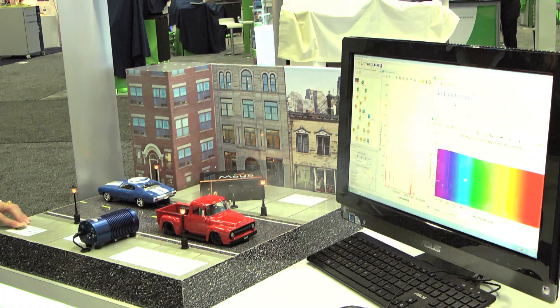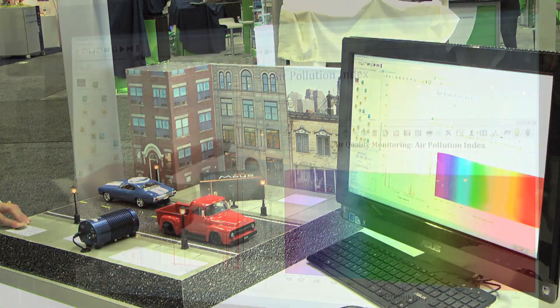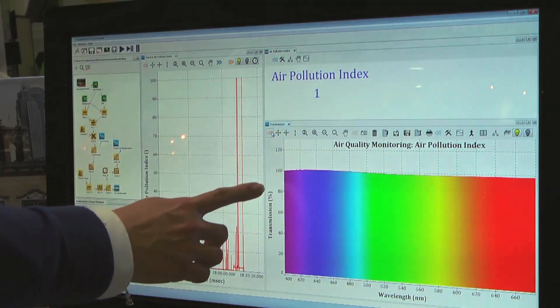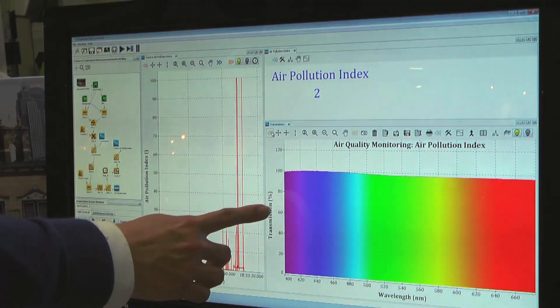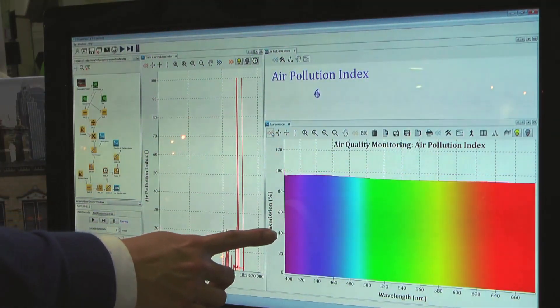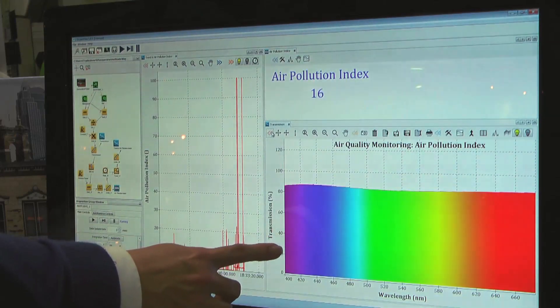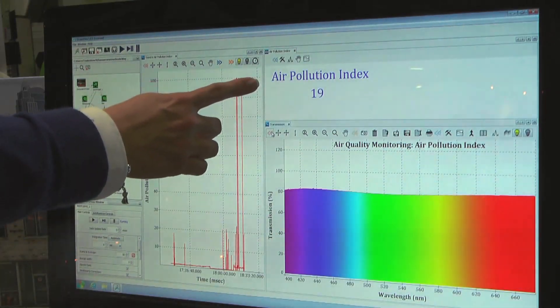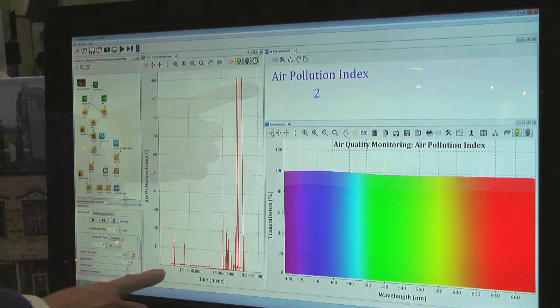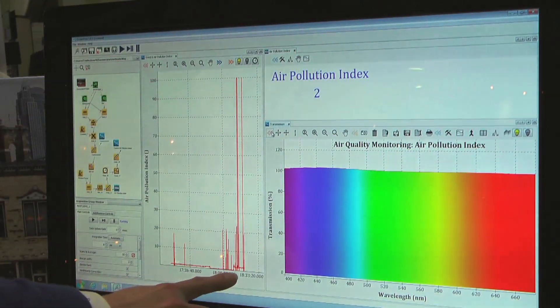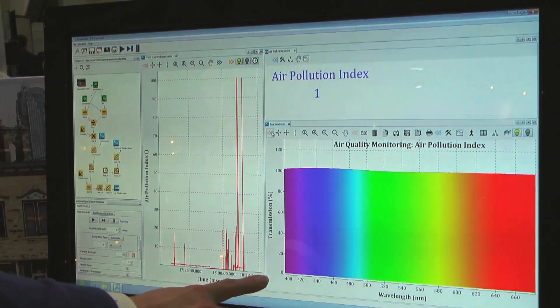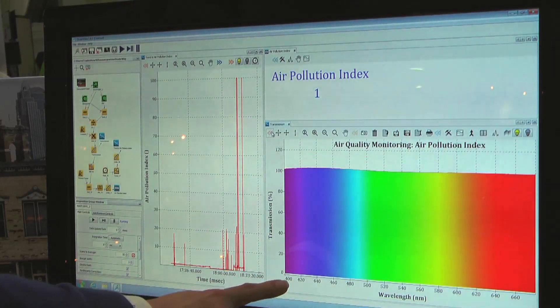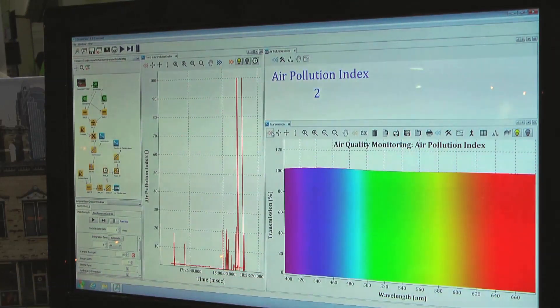As the car exhaust passes through our light path, we see a decrease in our transmission that is then tied to the air pollution index, which we're showing in OceanView. We can also track this value over time to determine when the air quality is at its poorest.